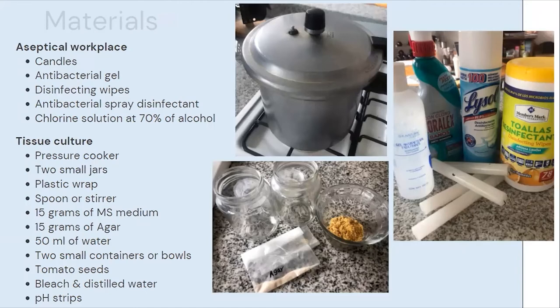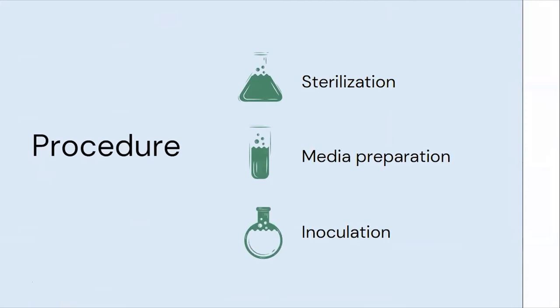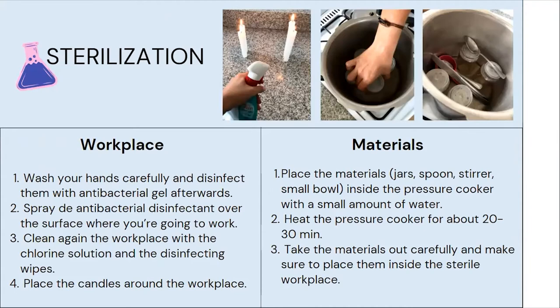The procedure is divided into 3 main steps: sterilization, media preparation, and inoculation. For the sterilization of the workplace, you have to wash your hands carefully and disinfect them afterwards with the antibacterial gel. Spray the antibacterial disinfectant over the surface where you are going to work.